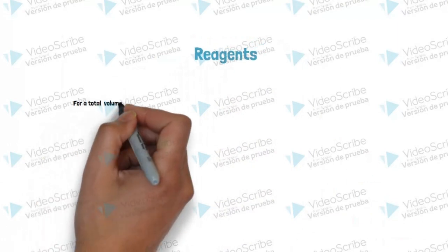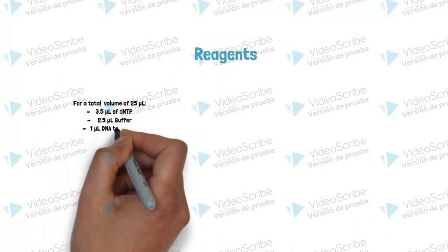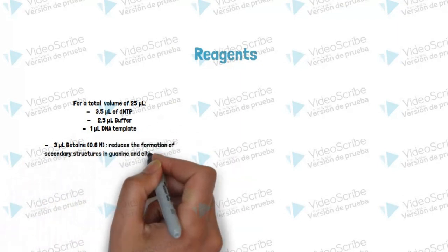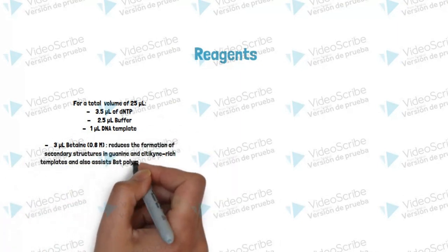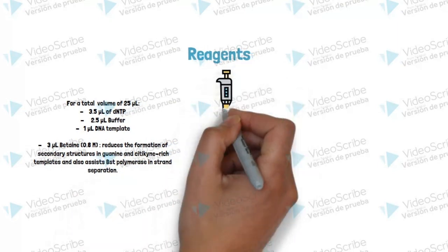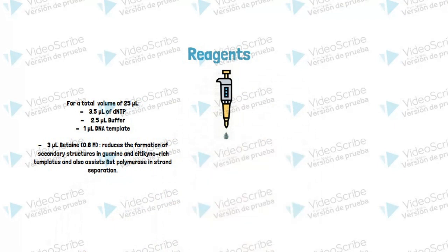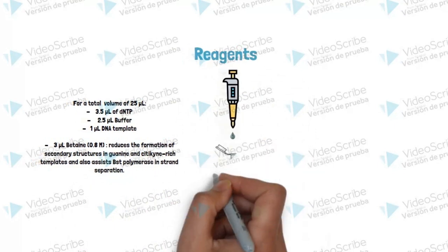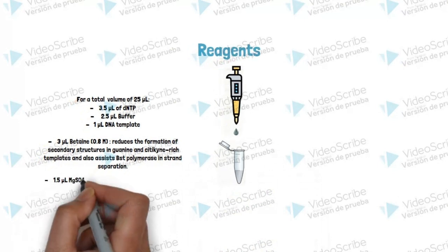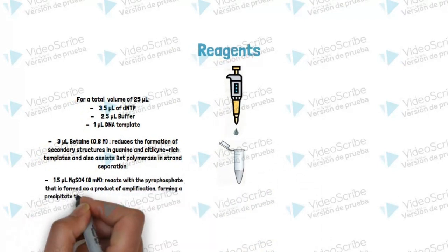The reagents used in this test are similar to the MPCR, using the dNTPs, the buffer, and the DNA template. The change here is the betaine, which reduces the formation of secondary structures in guanine and cytosine-rich templates, and also aids the Bst polymerase in strand separation. The magnesium sulfate reacts with the pyrophosphate that is formed as a product of the amplification, forming a precipitate that allows the test result to be observed.